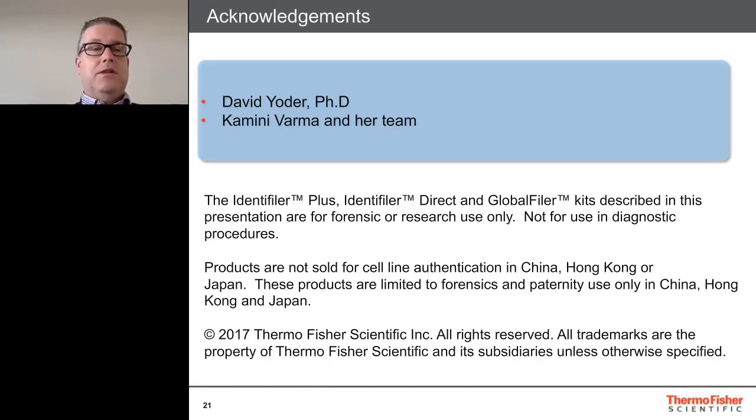Another question that we have received is that the Seq Studio that we've talked about in this presentation, what are the benefits of the Seq Studio? And there's people that want to know a little bit more about what it does. So this instrument is a new personal capillary electrophoresis instrument, if you will.